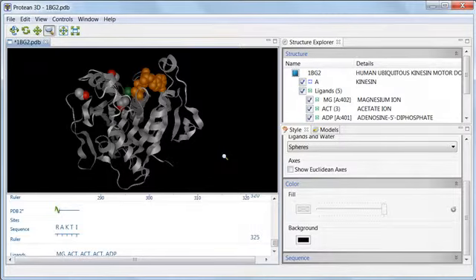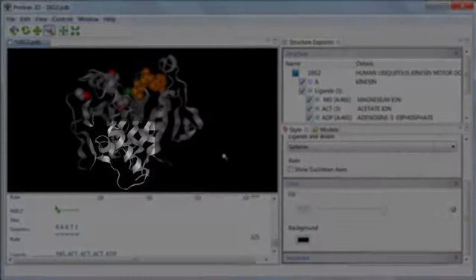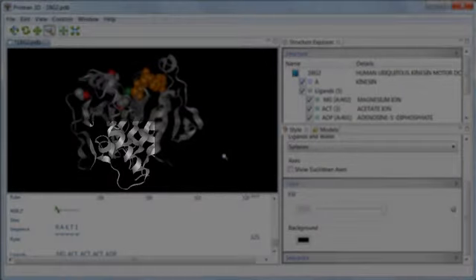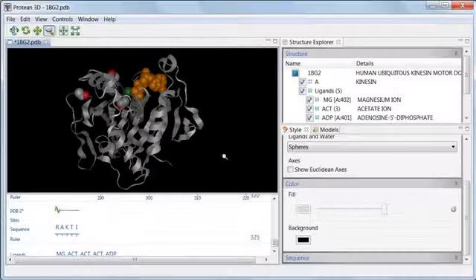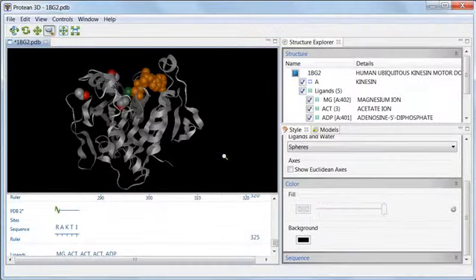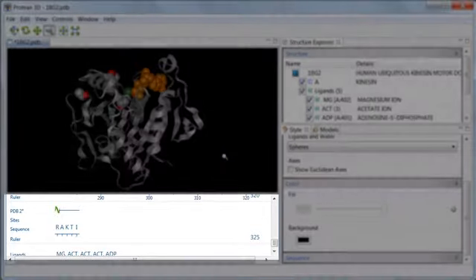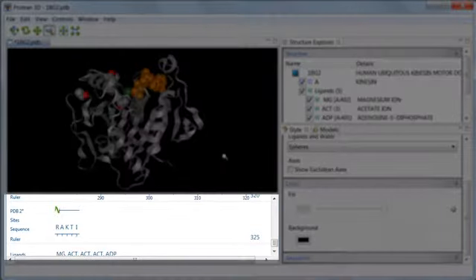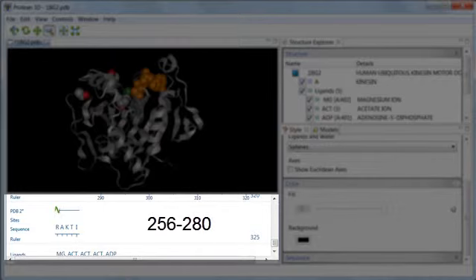Next, I want to select the relay helix. This relay element is actually comprised of two separate helices, plus the protein sequence between them. So instead of using the Structure Explorer to make my selections, I'll go straight to the Sequence view. I happen to know that the relay helix is located at sequence range 256 to 280.